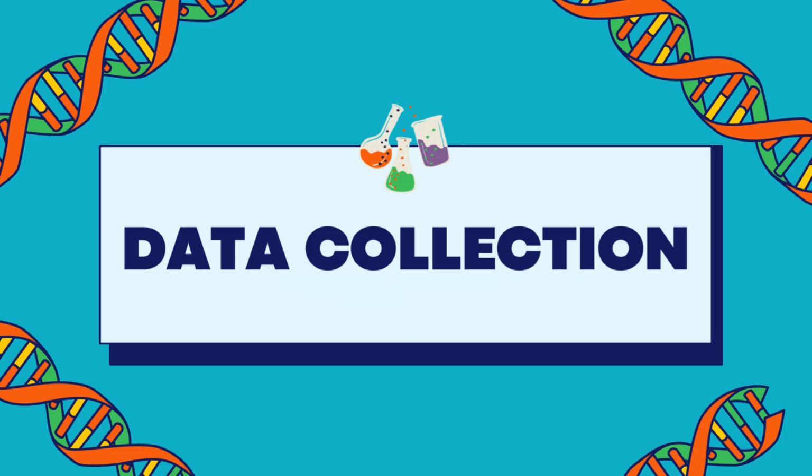We made sure the lysis buffer was heated to 60 degrees Celsius before adding the minced banana sample and stirred it for 5 minutes. After adding 1.5 grams of papain, we stirred for another 10 minutes. We then cooled the mixture in an ice bath for 5 minutes and homogenized it before filtering through 3 layers of filter paper into a test tube kept in an ice water bath.